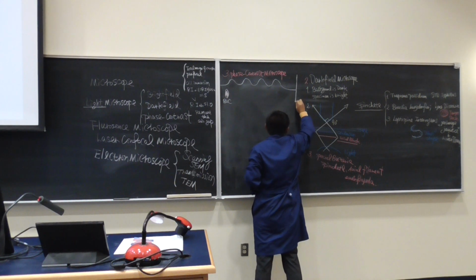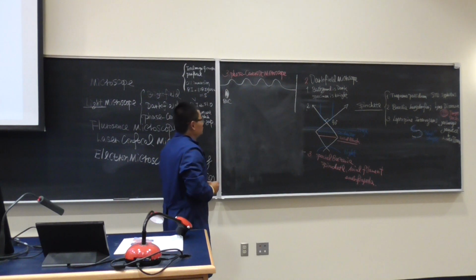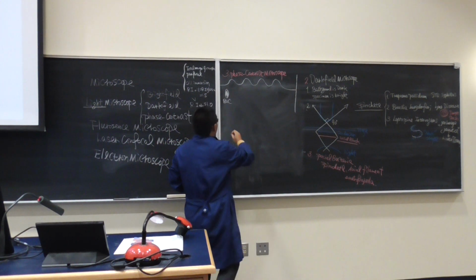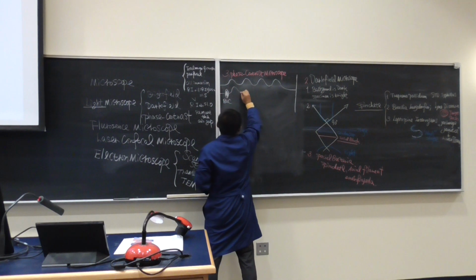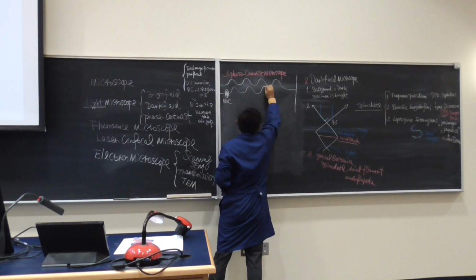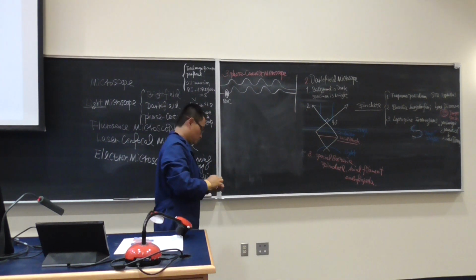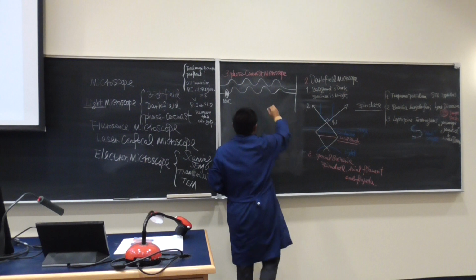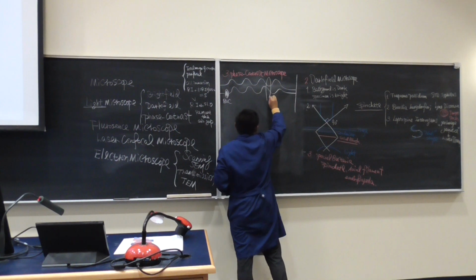Here is like an objective lens, for example. Now, generally speaking, the light coming through here is similar. Like that, for example. Now what happens is here you're going to put a ring.